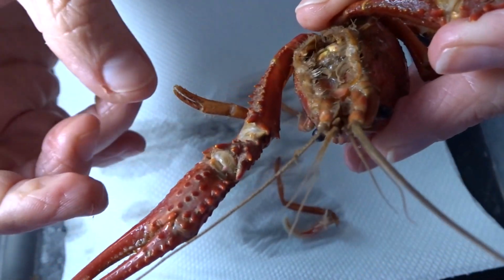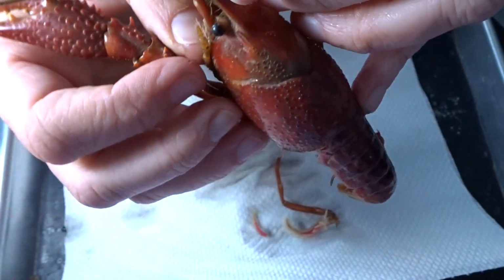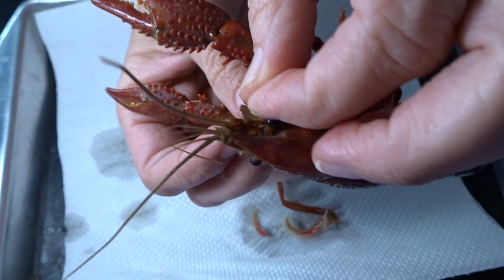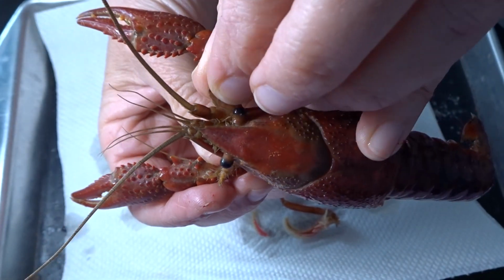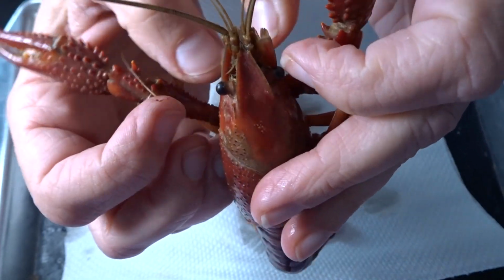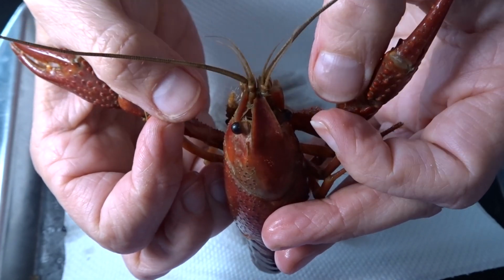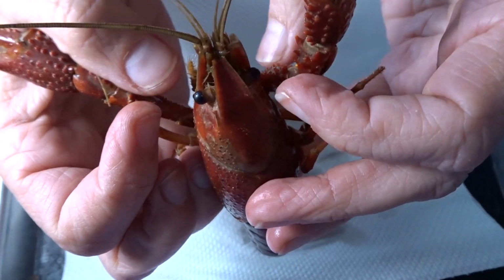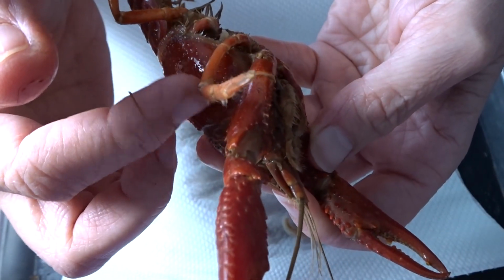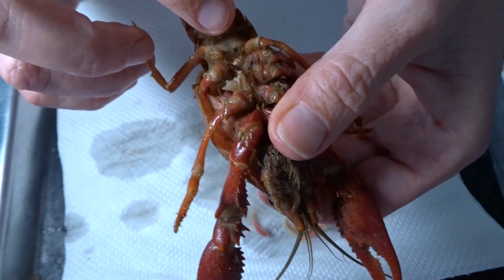So they're getting a little more advanced. Looking at this, it's pretty cool too. These fan out. Do you see that? They fan out, and these structures all around the mouth keep the water circulating so that when it excretes nitrogenous waste, it pushes that right out away from the mouth area. Even though it doesn't really matter, since it's not going to ingest it or inhale it, since gas exchange is across the gills.